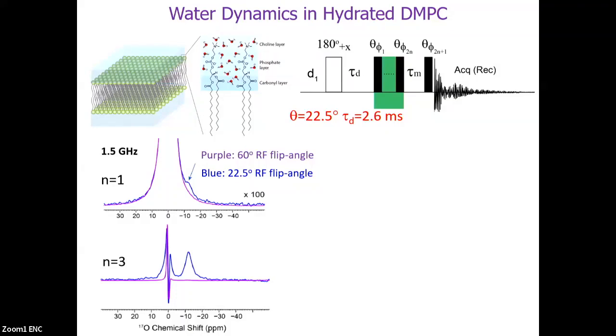resonance with a chemical shift fairly large away from the bulk water, which is at 0 ppm, and it's minus 11.6 ppm. If we compare to the previous 0.17 ppm, this is a pretty large chemical shift difference.